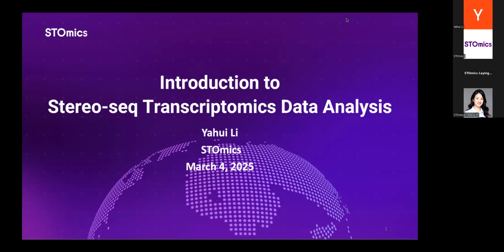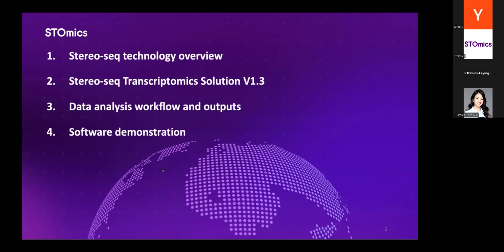Hello, everyone. Today, I would like to give you an introduction to the Stereo-seq transcriptomics data analysis. My presentation today includes 4 sections. First, an overview of Stereo-seq technology, then introducing the Stereo-seq transcriptomics solution v1.3 product. Next is the data analysis workflow and main outputs. And lastly, a hands-on software demonstration. I will spend about 20 minutes on the first 3 sections and another 15-20 minutes on the software demonstration.